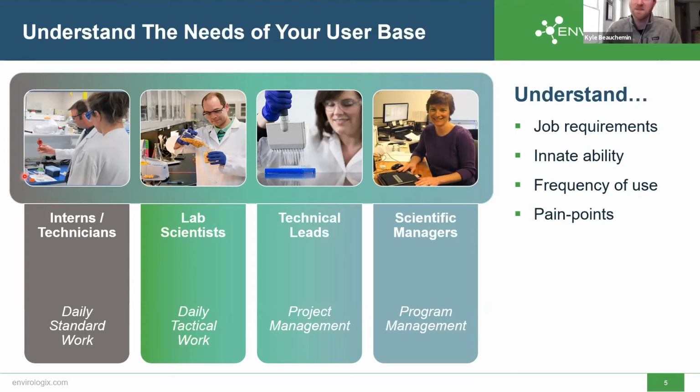So try to understand specifically what are the pain points that impact efficiency or engagement for your team today, and how will the next implementation, your next ELN, attempt to alleviate that for your team.